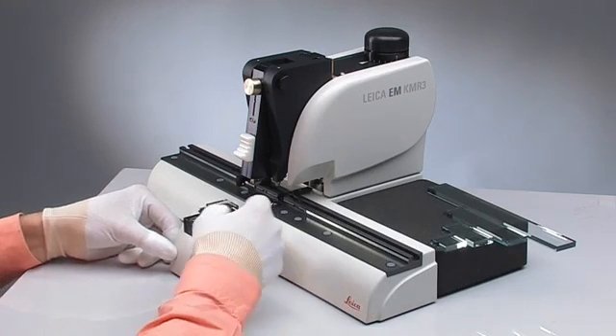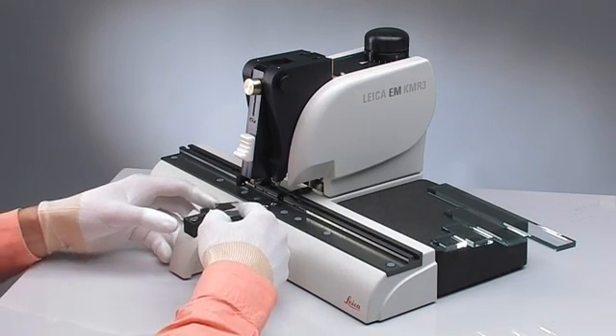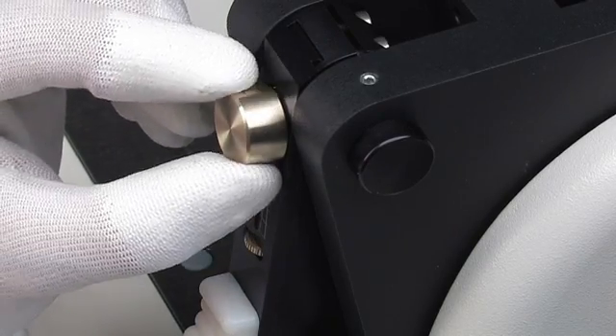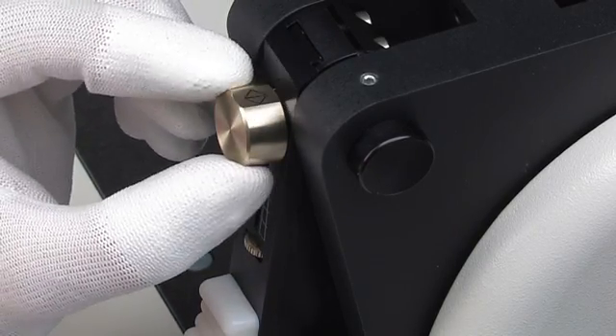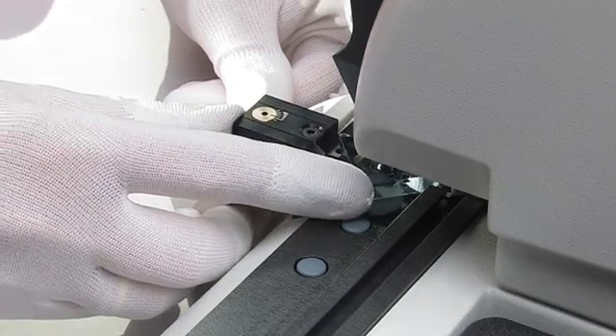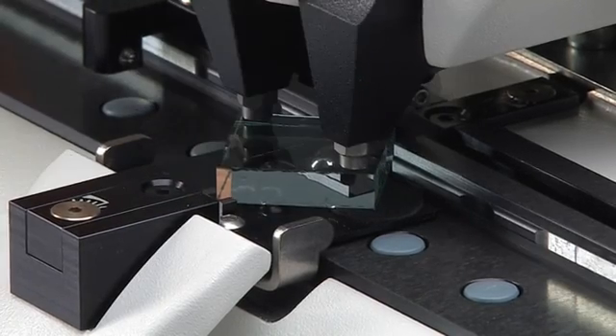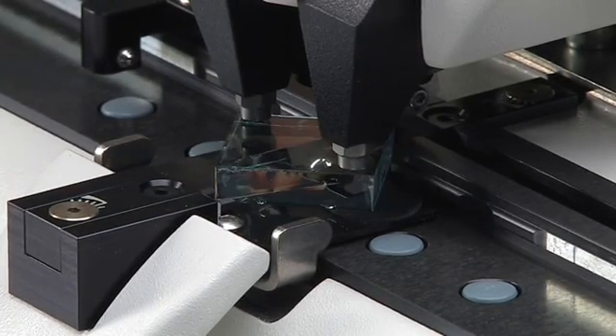After the break, the scoring and breaking mechanisms reset automatically, ready for the next score. The unique knife drawer allows easy positioning of the glass square and safe removal of the final knives without the need for any additional tool.